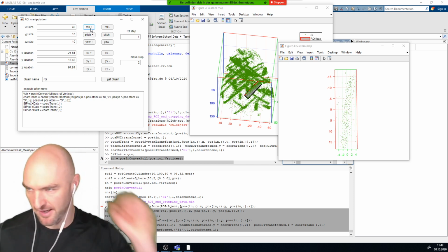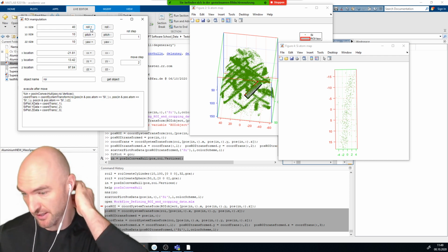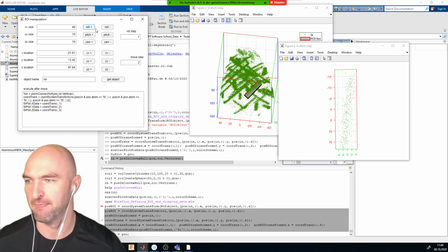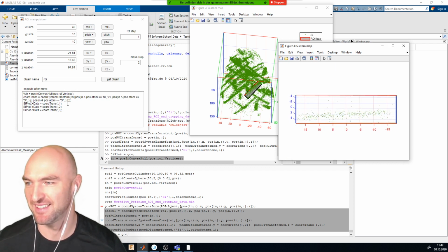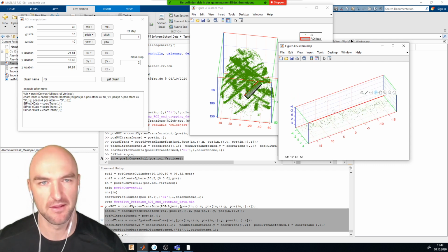So the convex containment test is implemented as QHull. I know there are more modern algorithms, but unfortunately I don't have them. The point is in convex polyhedron. This is correct. Yes.